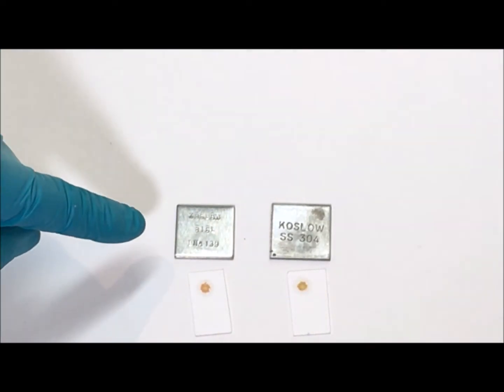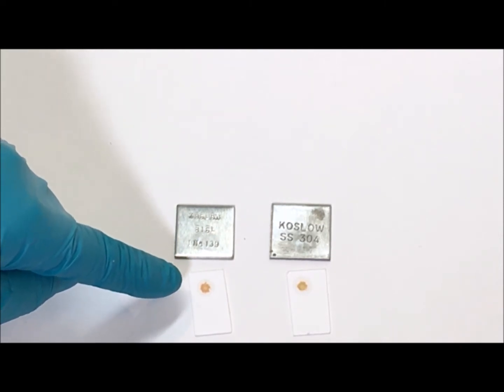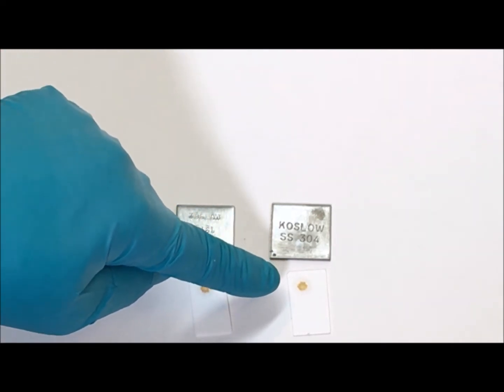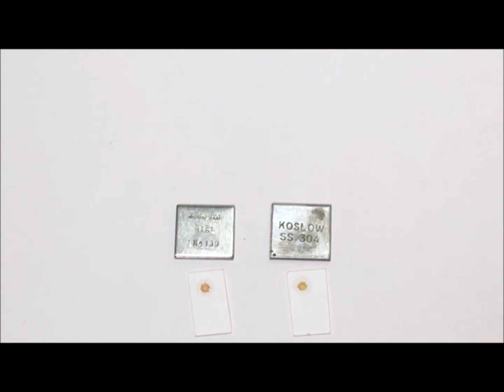I can see already that the 316 is giving a reddish spot and the 304 is not. It's more like a yellowish spot, but we'll give it some time and see if it looks a little better.